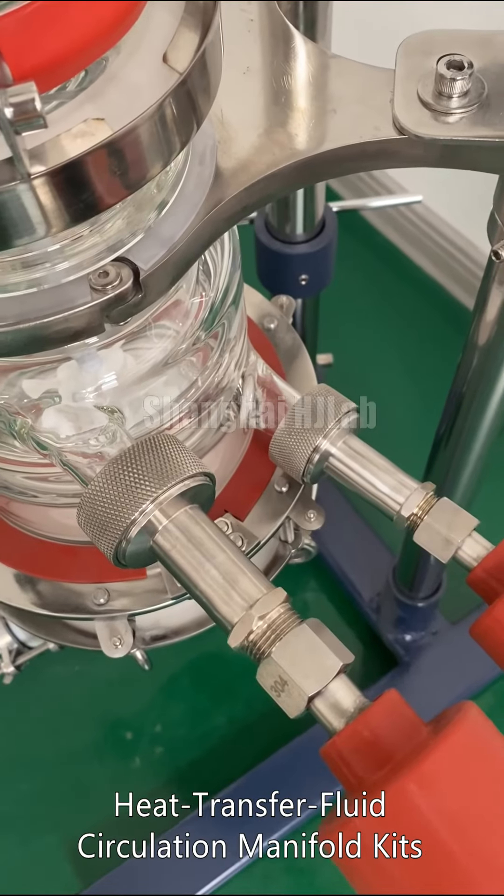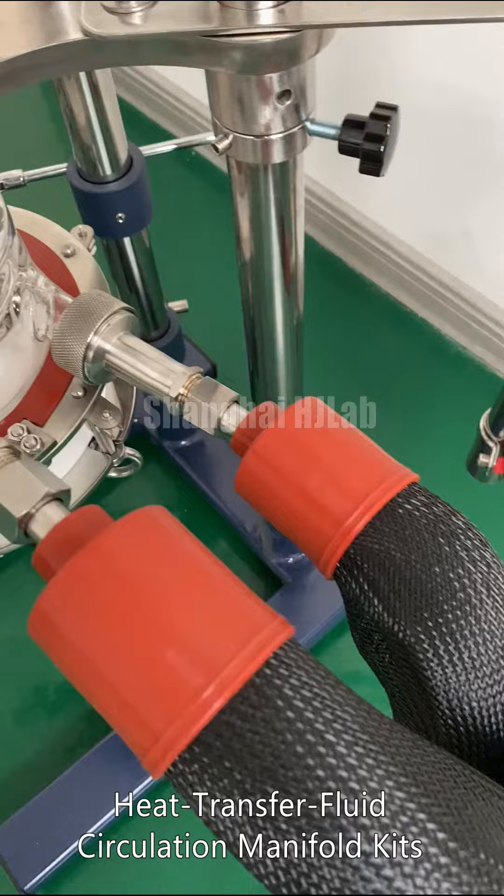Heat transfer fluid circulation manifold case.